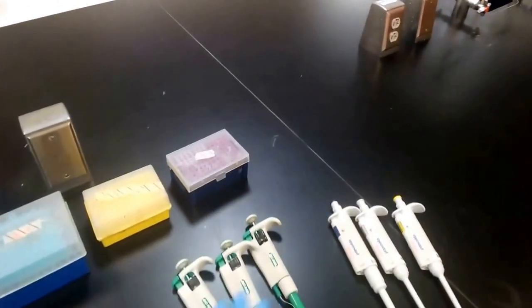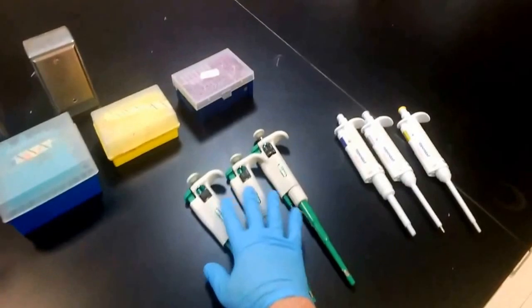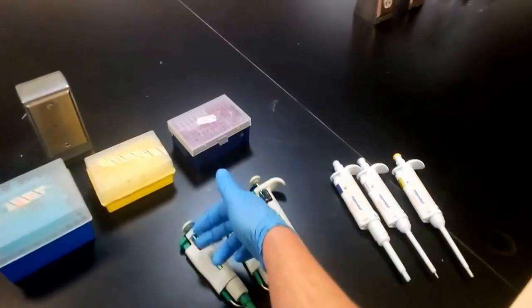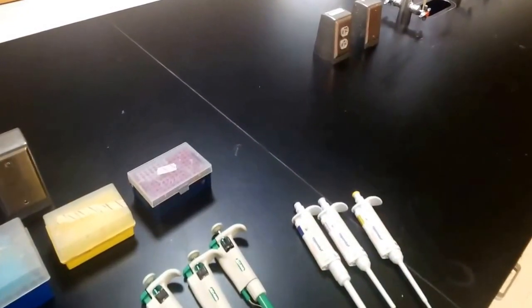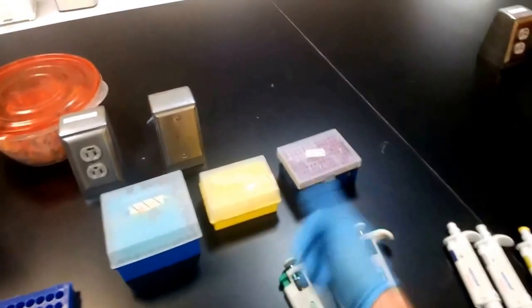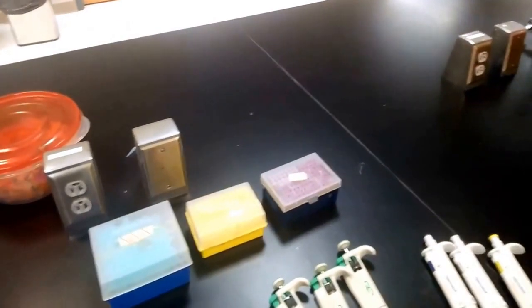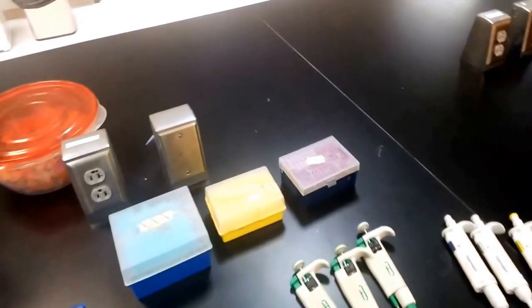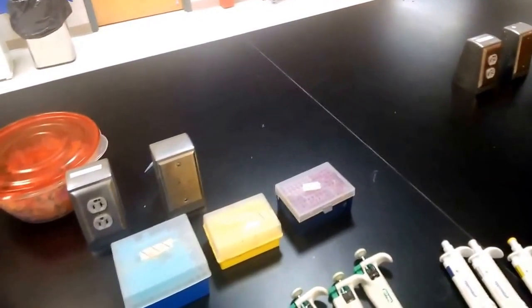So these are very precise instruments that have a complex assembly of gears inside in order to pull a very precise amount of liquid from micro test tubes. And they also come with disposable tips that you can eject and throw away each time you're moving solutions in order to keep your solution sterile or to keep from contaminating one test tube to another.